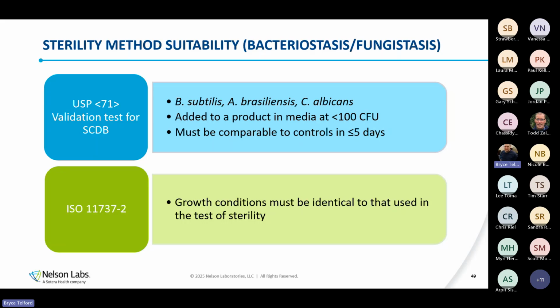Whereas in a test of sterility, I'm not generally filtering anywhere. I'm taking the product, I'm putting it in the bottle. That inhibitory substance is either being neutralized or it's being diluted out. So one test does not correlate to the other. Just because I have an acceptable sterility method suitability doesn't mean I have an acceptable bioburden method suitability, and vice versa. They're very different tests in that aspect.